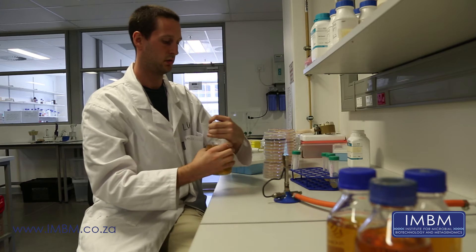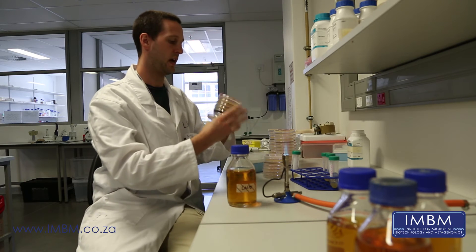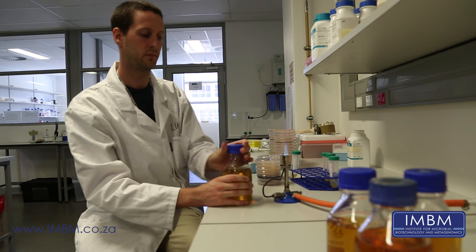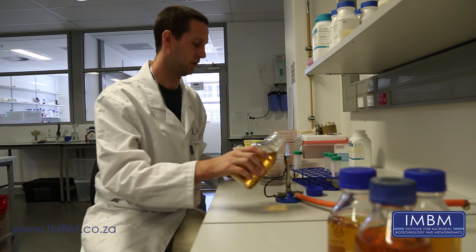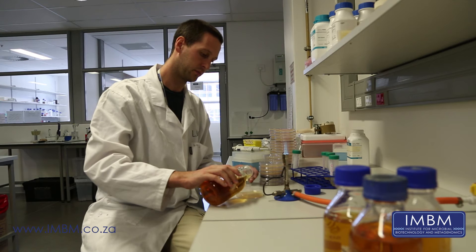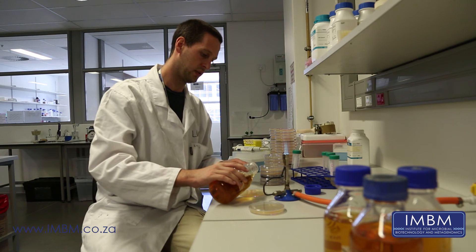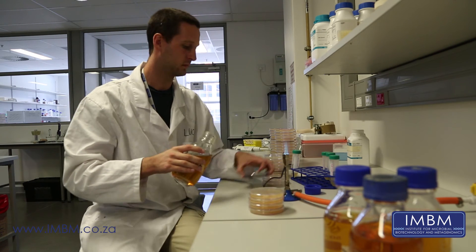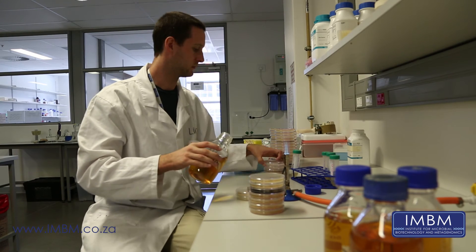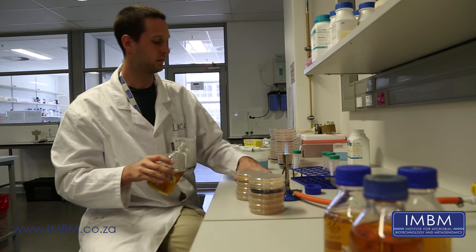Sterilize the lid and just give it a mix. Here we have all of our assay plates. The first thing to do is set them the wrong way up. Sterilize the opening of your bottle again, take a plate, and pour approximately 10 ml of molten agar on top. Give it a swirl and set to one side. Again with the next plate, approximately 10 millilitres.